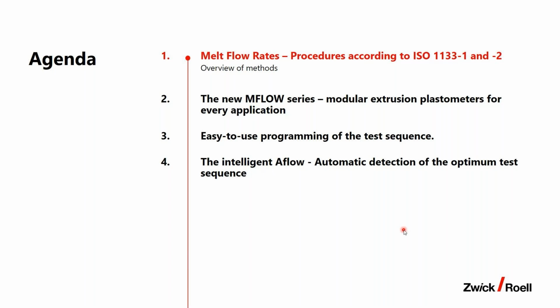I will talk about programming of MFlow sequences, and shortly present the AFlow, which is a more automatic MFlow testing. So this is our program for the next, I would say, about 30 minutes.